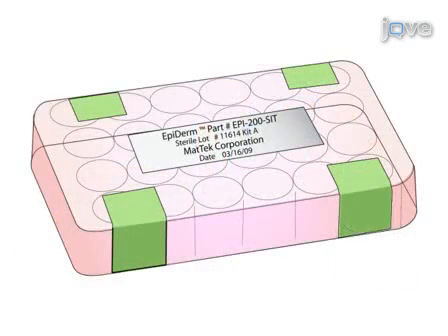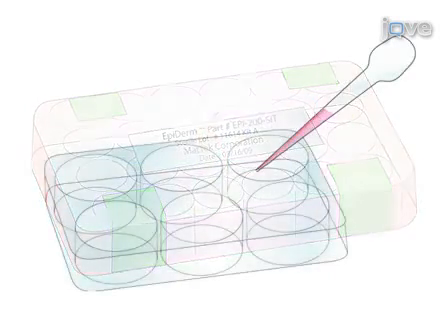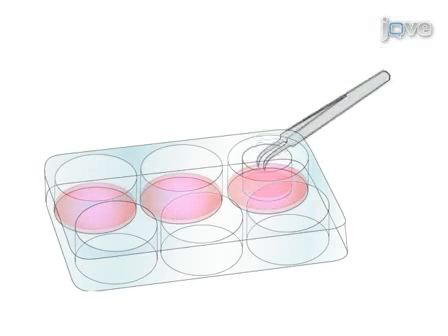This test begins on day 0 when the skin irritation kit and epiderm tissue arrives in the lab and is subsequently pre-conditioned in assay medium.